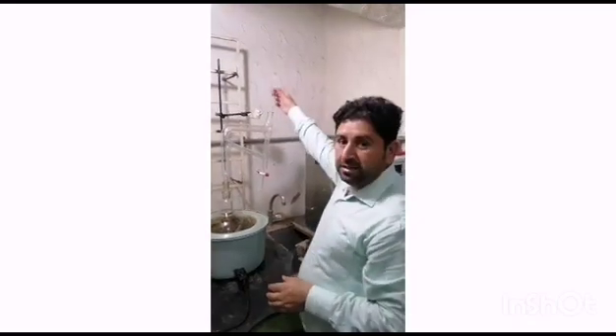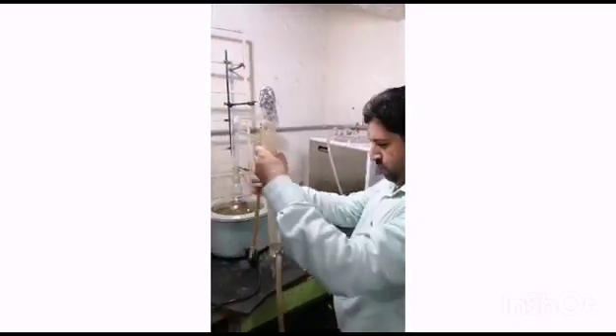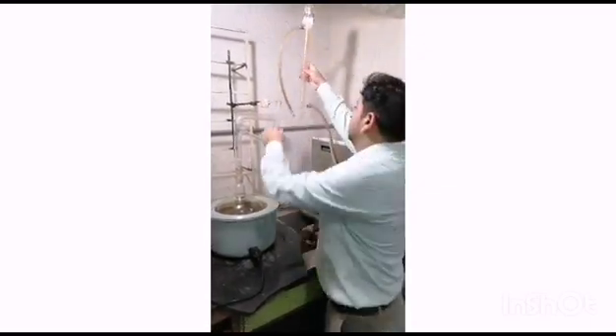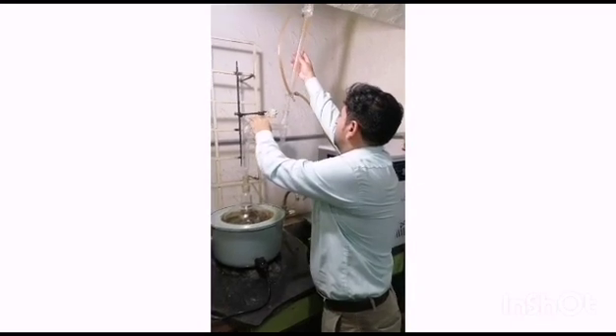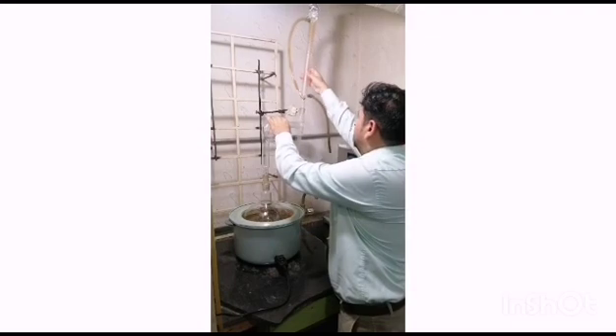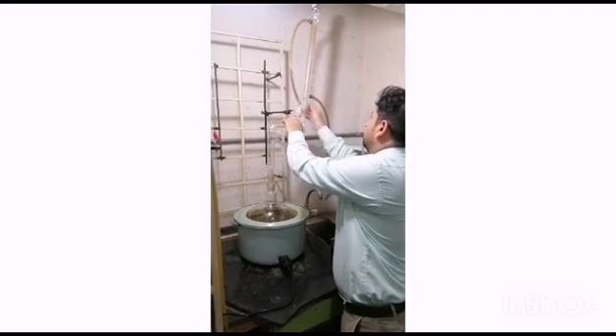Then we need to put a condenser here so that the vapor should be condensed. We also put some grease here, and we will put the condenser here and smoothly rotate it so that it fits properly.